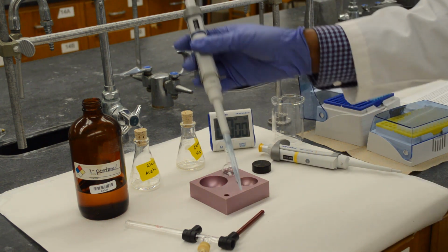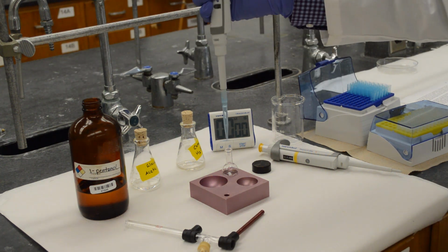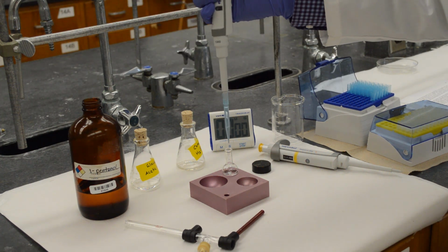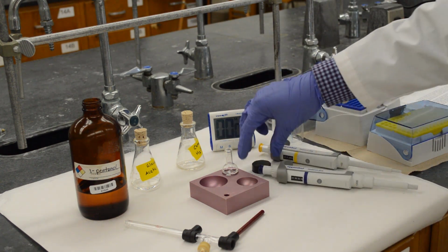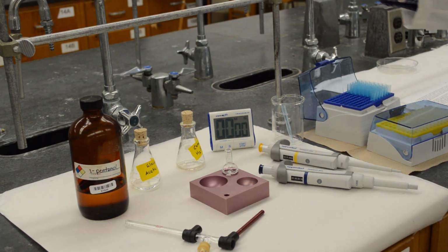Okay, this is 1 ml. We have exactly 2.7 ml of 1-pentanol.